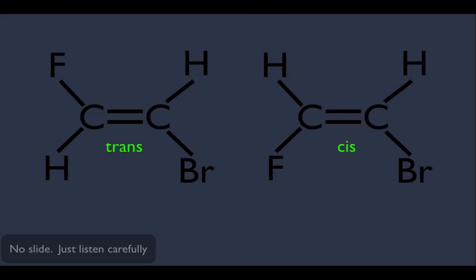For instance, let's label the first hydrogen right here for the trans. Let's call him the A hydrogen. And let's call the other hydrogen over here the B hydrogen. And let's do the same thing for the molecule on the right, the cis. Let's call him the A hydrogen, and let's call him the B hydrogen. So right here at this point, both molecules would have two signals in their H NMR. So we couldn't use that aspect to distinguish these two molecules.